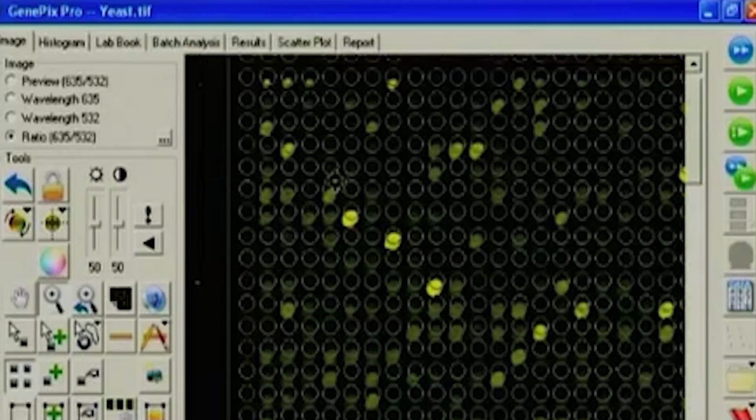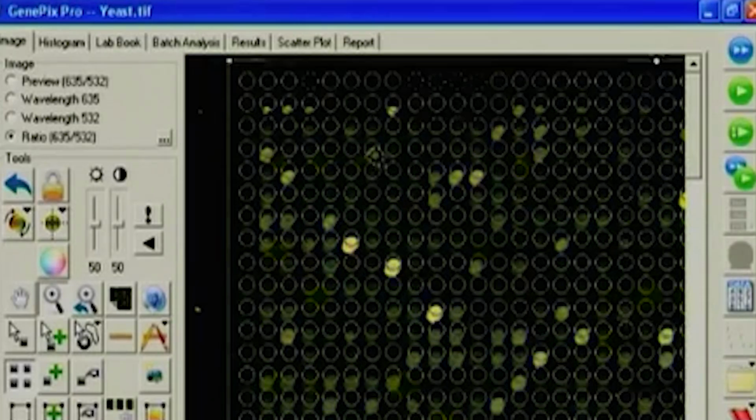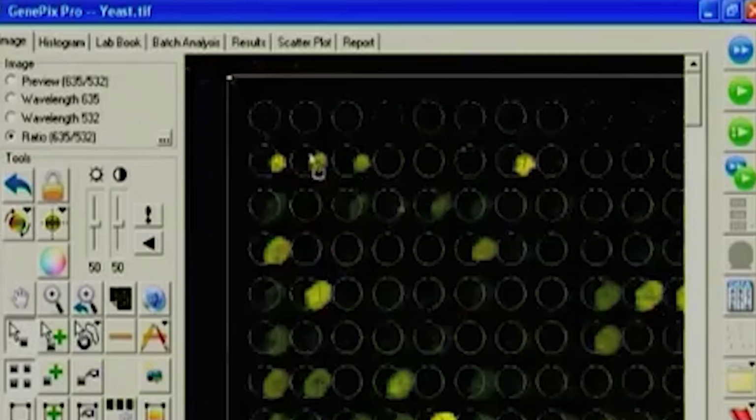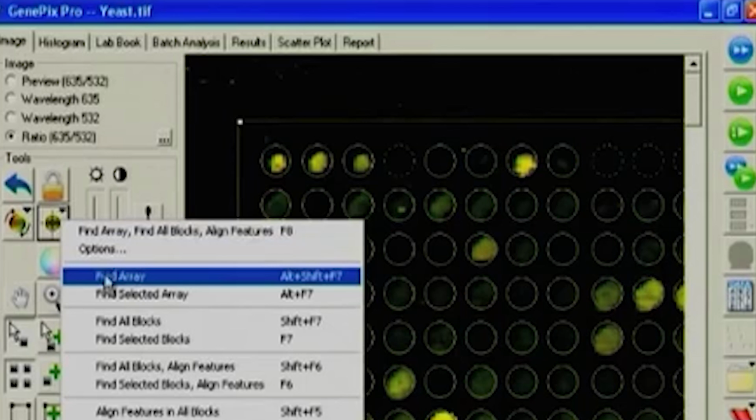And we need to fine tune that alignment for overall proper image extraction. So the only thing you have to do here is take your block and move it to the first alignment. Then you can click the button over here, which is for align. Align can be done in different ways.